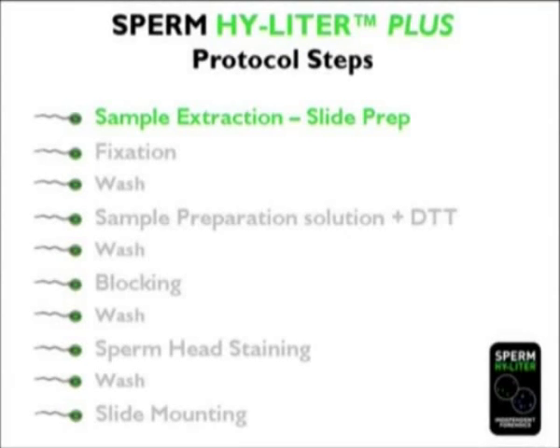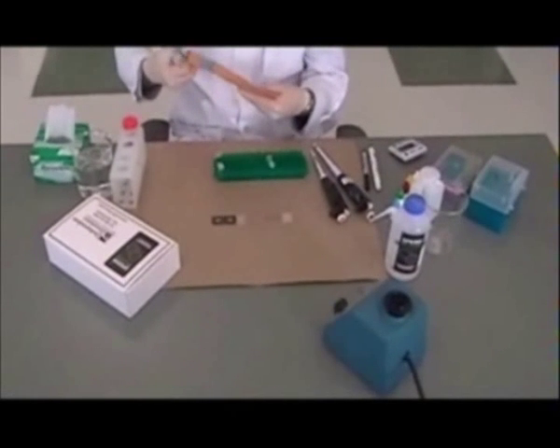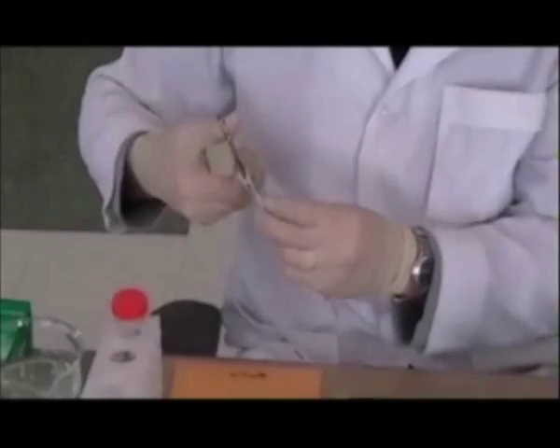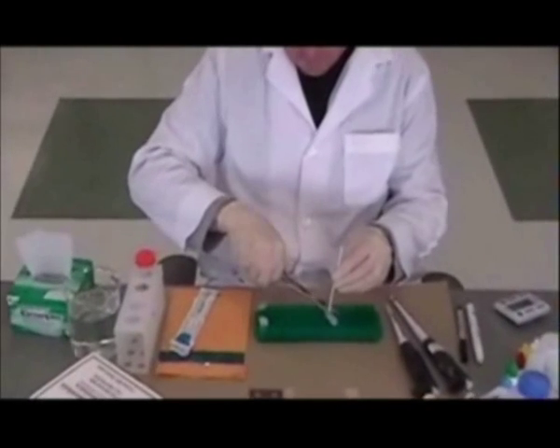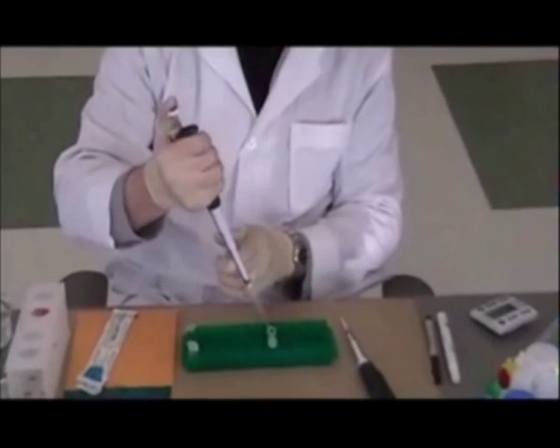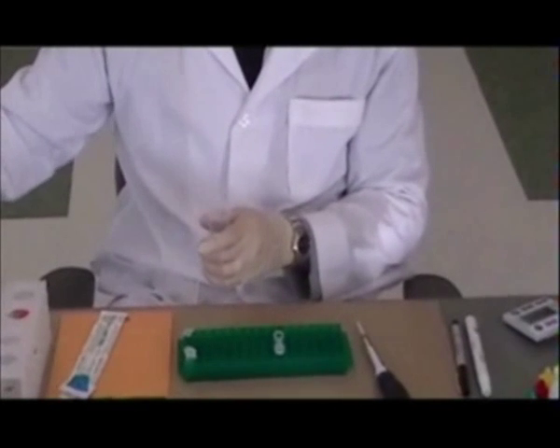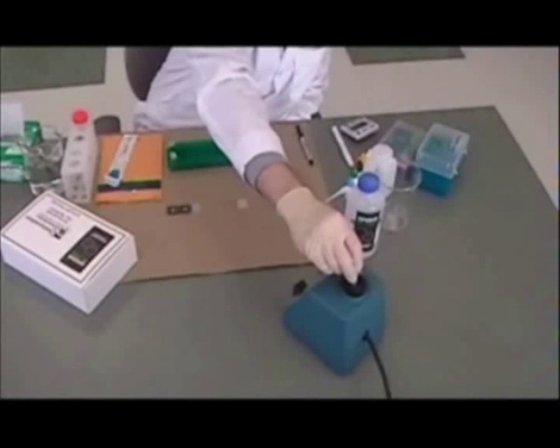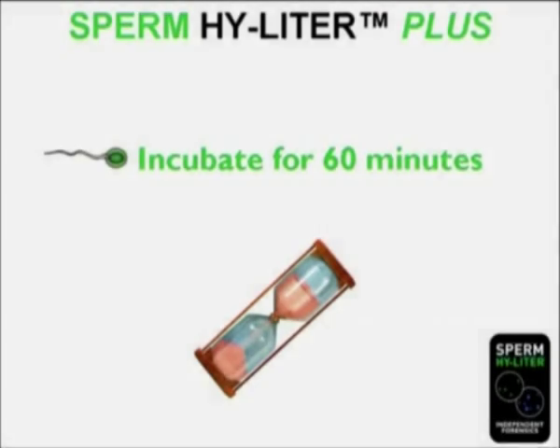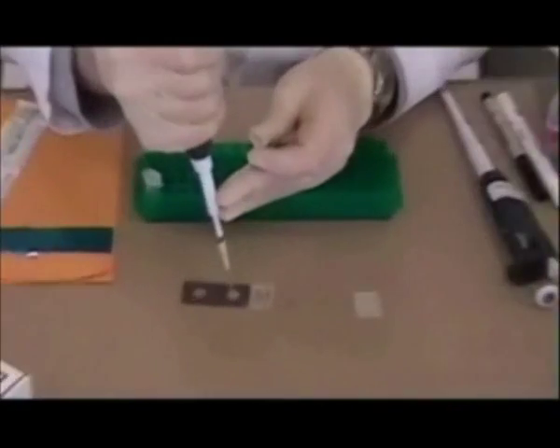Here we show the preparation of an extract from a swab. First, the swab head is cut into an extraction tube and PBS is added. The extraction tube is vortexed and incubated at room temperature for one hour. Next, a portion of the extract is applied to the sample window of a Sperm Highlighter slide and air dried.